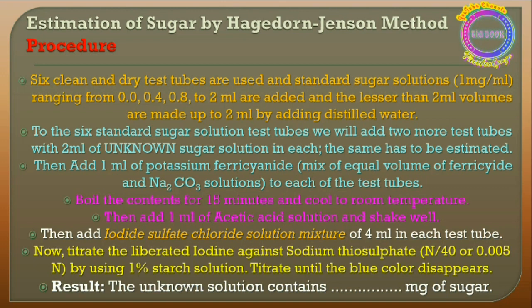We are going to take 6 clean and dry test tubes for the standard sugar solutions, ranging from blank to 0.4, 0.8, up to 2 ml.